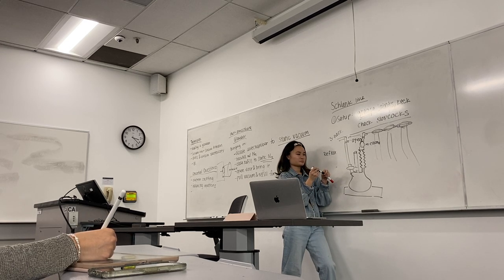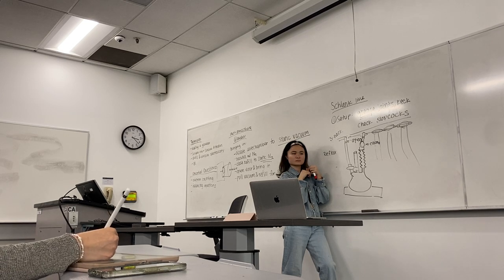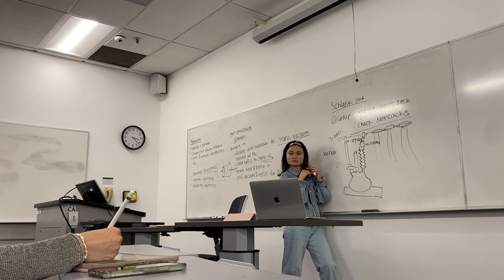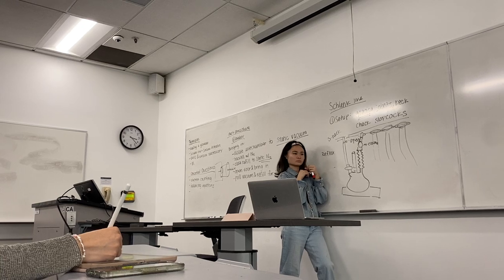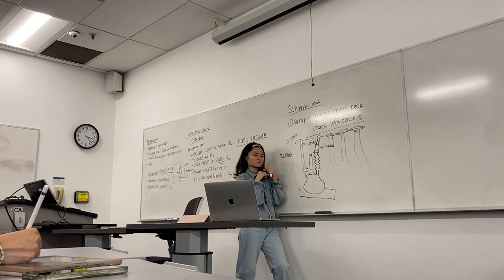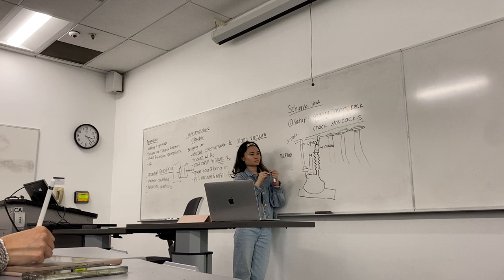Can one of my students answer another reason why you should not have that stopcock close to the condenser? Brandon? Is it to do with the pressure inside of it? Oh, it can. That happened, yeah, we closed it and the pressure built up and it just popped the septum in the middle out. Yeah, so you never want to heat in a closed system. Yeah, but also the first reason. Oh, if that's open, yeah.